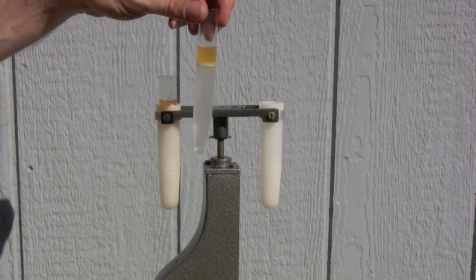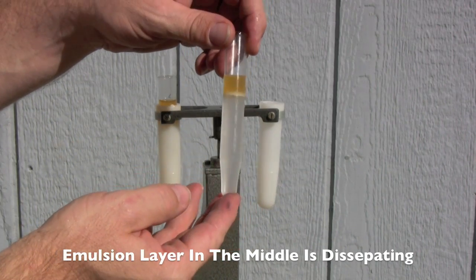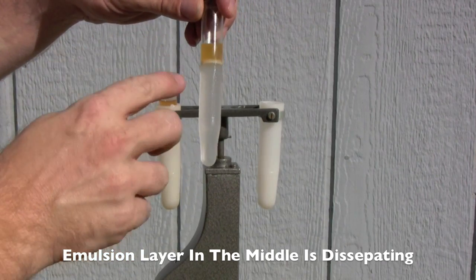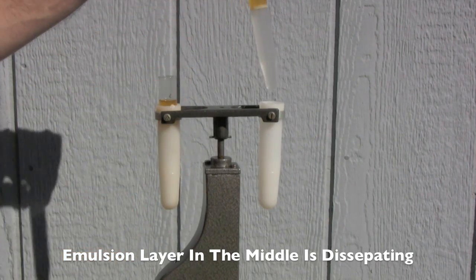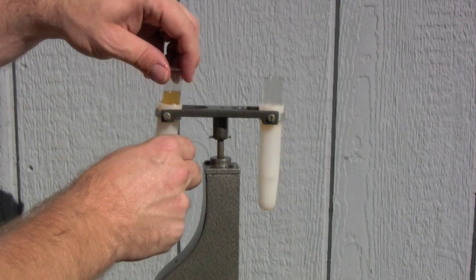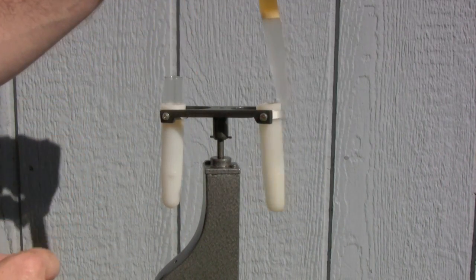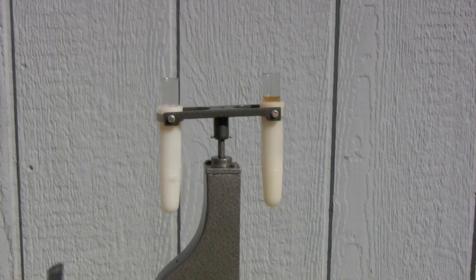This is after centrifuging a little bit longer. Looks like the water on the bottom is starting to come clean, the stuff on the top is coming clean, and the layer in the middle is cleaning up. Check our other sample — there's a little bit of a soap layer there. This is the Whirlybird centrifuge at work.